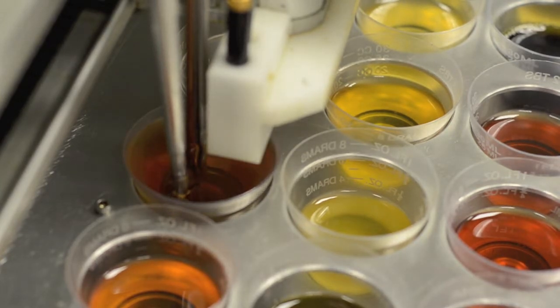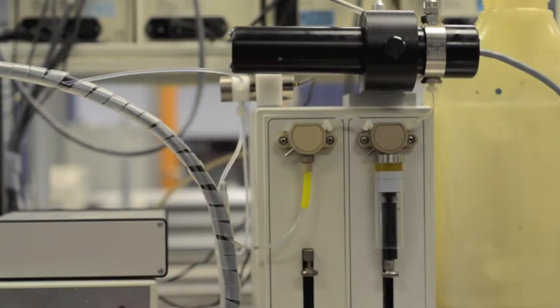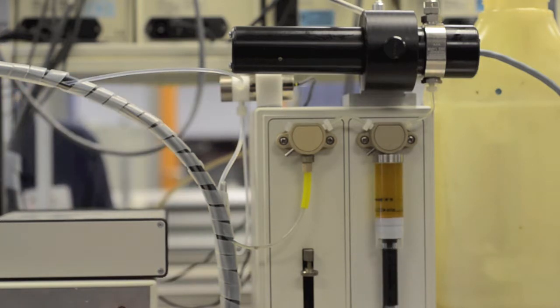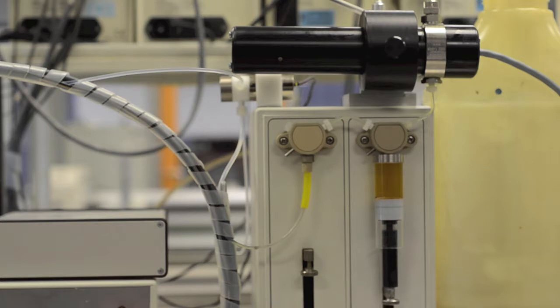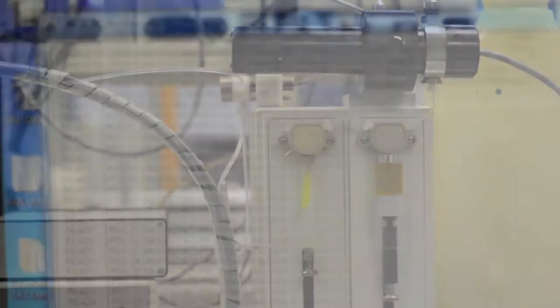The sample is stirred according to the time and for the speed specified in the batch file. The syringe pump first uses a small amount of sample to flush the lines and sensor. Next, 23 milliliters of sample is pulled into the syringe at a preset flow rate of 30 milliliters per minute. Three samples of 5 milliliters each are measured by the multi-channel particle counting sensor. Testing is now complete.